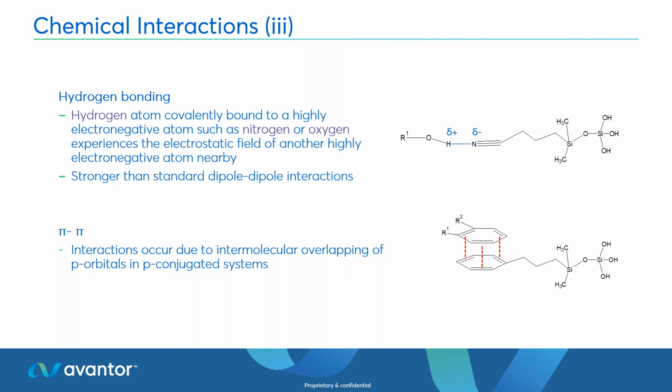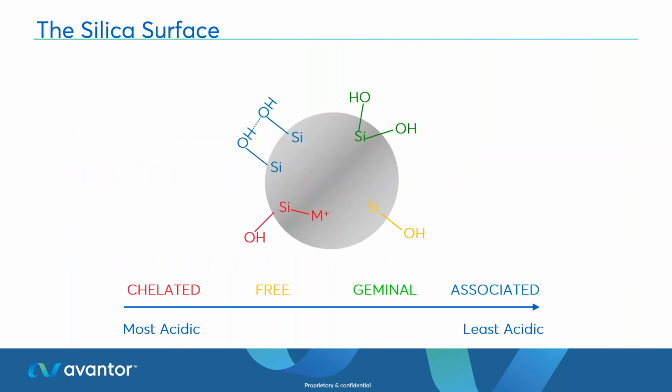So if you go back to basics, how we're manufacturing these columns, predominantly most of us have silica-based columns. So on top of a silica particle, you have these residual silanols. And these are fantastic because it's what we bond to when we want to add that C18 chain.